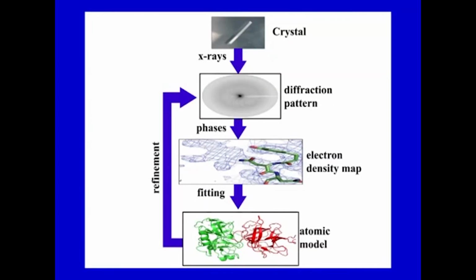So, the major aspect here, if we go through the procedure, is that you have the crystal, X-rays are focused on the crystal, and the X-rays are diffracted by the crystal. What you get is a diffraction pattern in the form of intensity. This diffraction pattern is characteristic of that particular molecule. In a microscope you have an objective and eyepiece, and finally you see the image, but here there are no lenses to focus the X-rays.